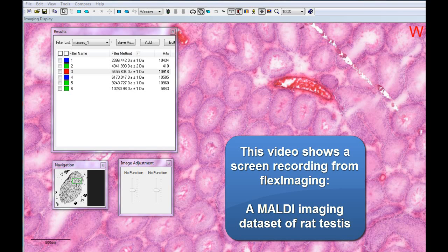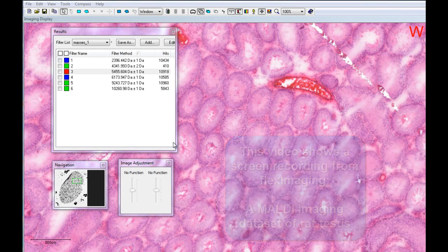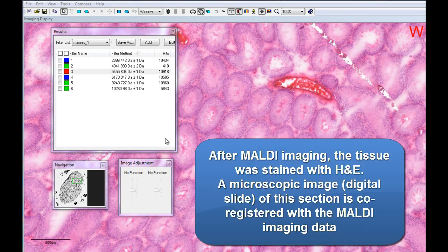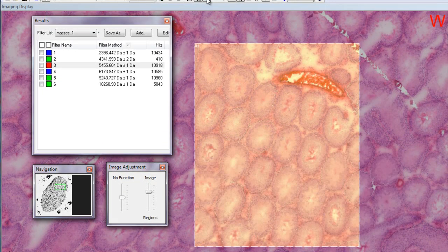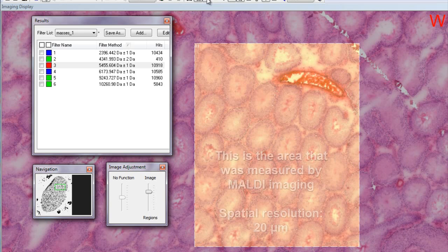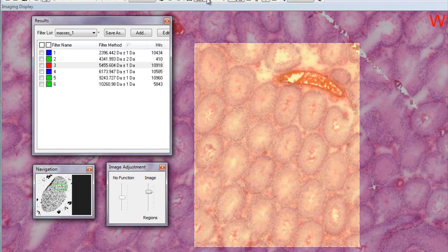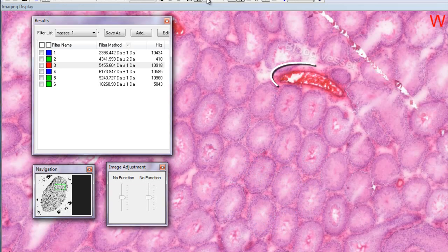The following video shows a MALDI imaging data set of a cross-section of a rat testes. Following MALDI imaging, the tissue was washed and stained with standard H&E protocols. Then a microscopic image of the stained section is co-registered with the MALDI imaging data set. Here you can see the area that was measured by MALDI imaging at a 20 micron spatial resolution.